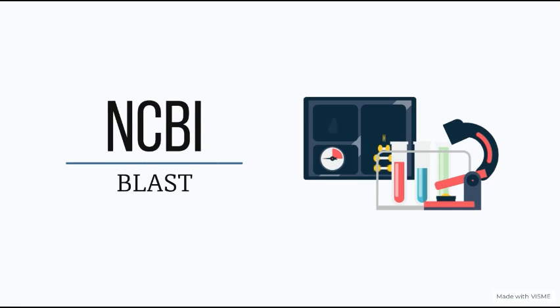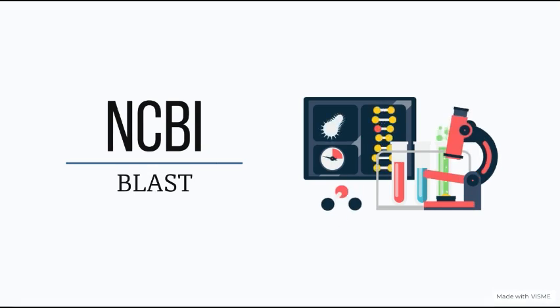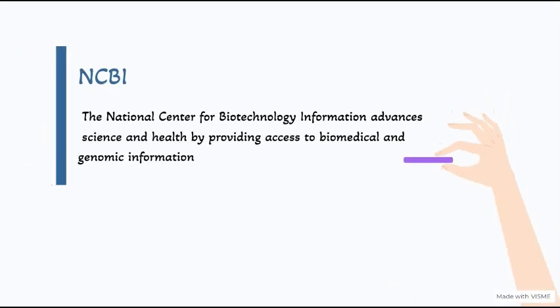Hello everyone. This video is an introduction to how to use the NCBI BLAST tool for your genetic research. First, NCBI, the National Center for Biotechnology Information, advances science and health by providing access to biomedical and genomic information.